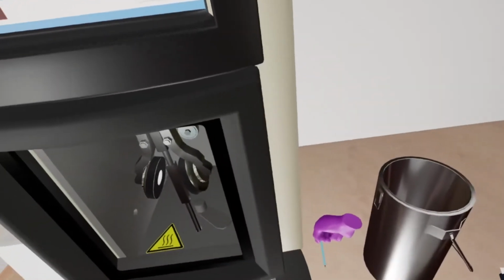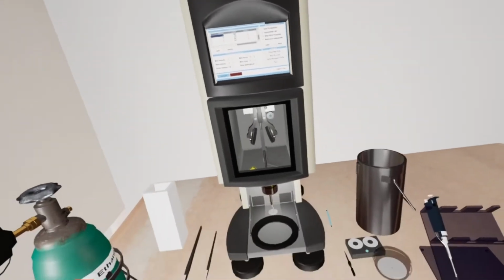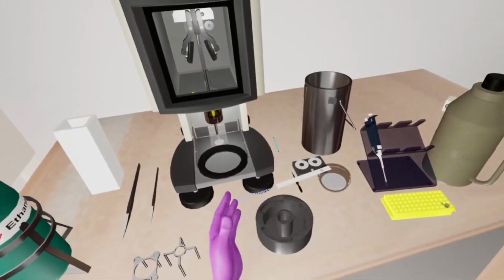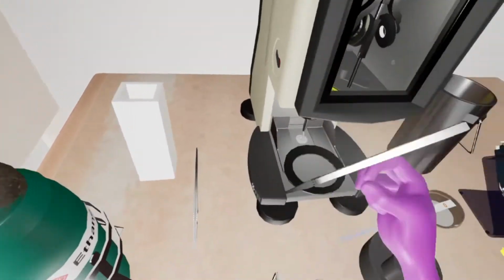Pick up the workstation which is in the hood and put it on your desk. Place brass ethane cup, grid box holder, and spider inside of the circular foam base.